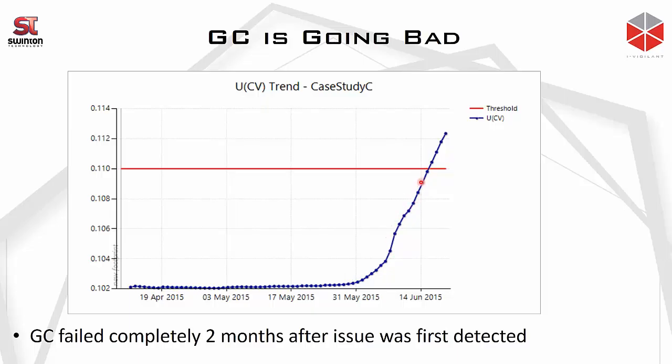The response factor drift goes so slowly that normal day-to-day calibration will not be able to detect it. Also, when we do repeatability tests, for instance, they will always pass. So when we detected that there might be something wrong with the GC when it hit this alarm point, the conventional method of analyzing the GC didn't detect anything.